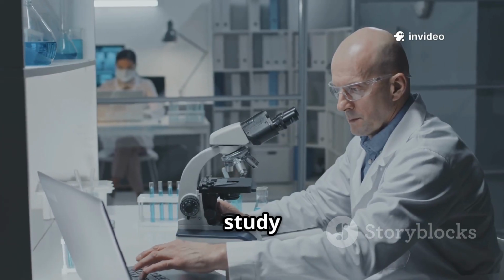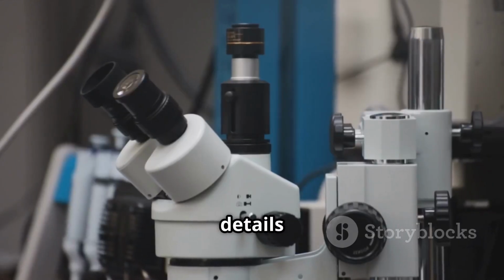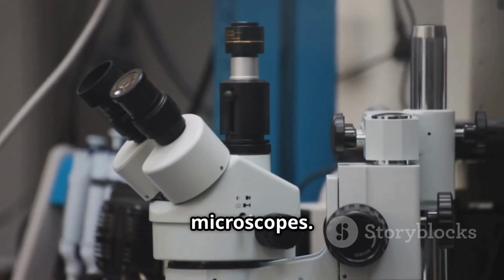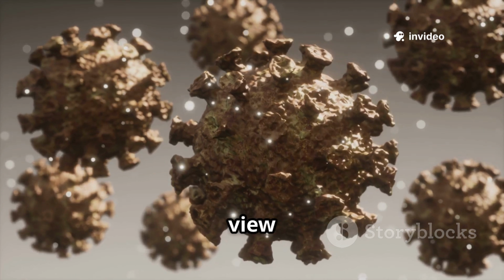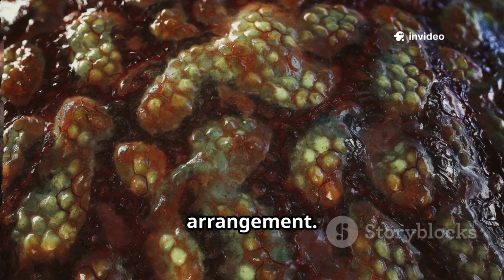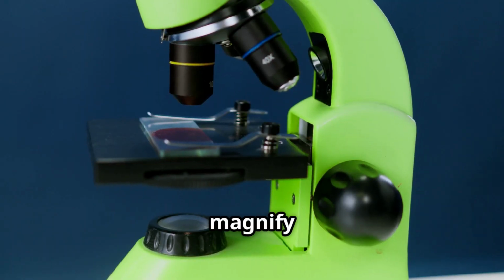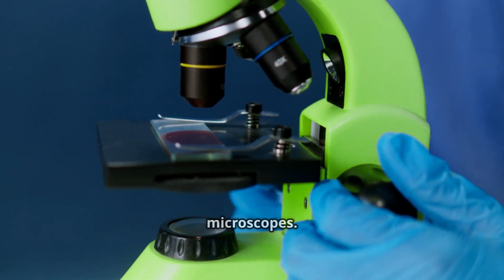Scientists use SEMs to study everything from cells and insects to metals and rocks, uncovering details invisible to light microscopes. The SEM gives us a 3D-like view of a sample's surface, showing texture, shape, and arrangement. By using electrons, which are much smaller than light waves, SEMs can magnify thousands of times more than regular microscopes.